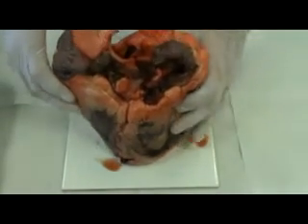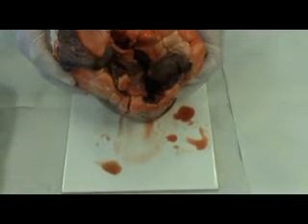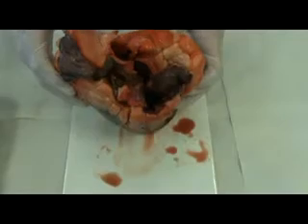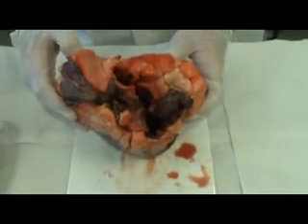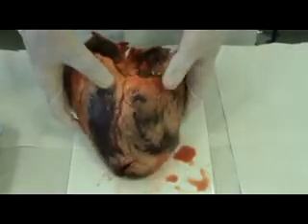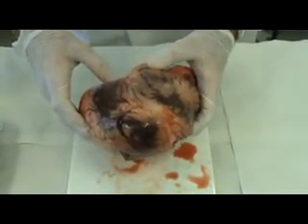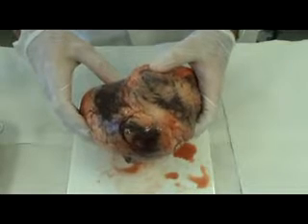The view on the top of the heart, just there, is the superior view, and you can see a variety of blood vessels there. And if we turn it around, the end bit, the apex of the heart, is the inferior view.